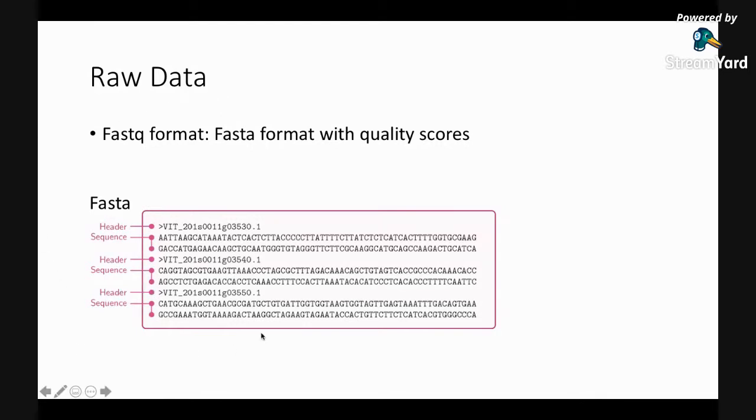You will get information of your sequencing run with most possibly the index and the adapter sequences in your raw data, because this is sequenced, so it is part of your data and part of your file as well. This is something that we have to remove.